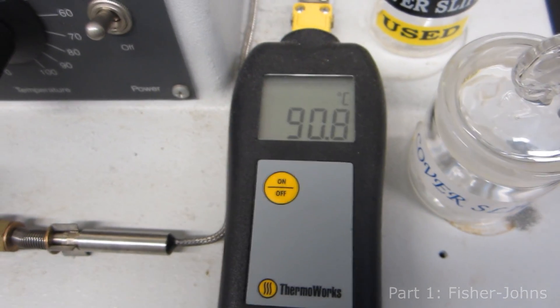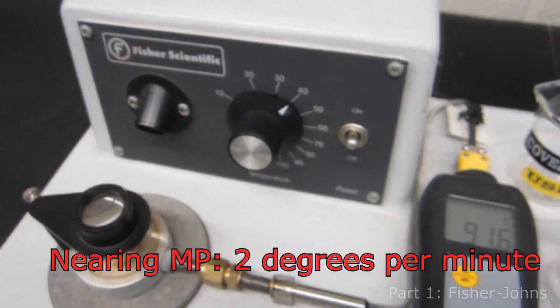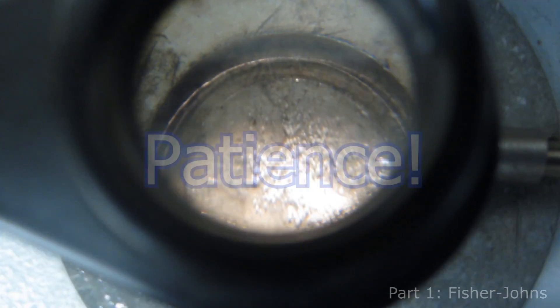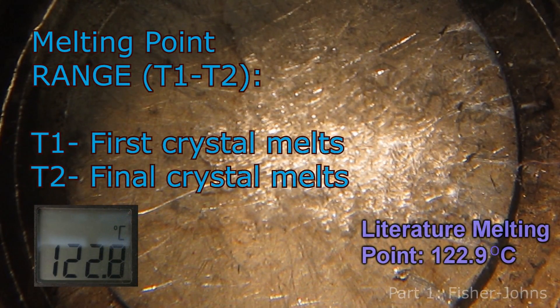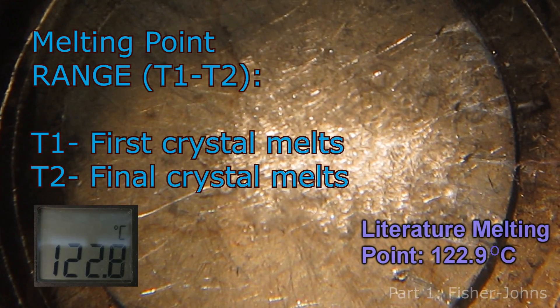Nearing your melting point, be sure that the temperature is not rising by more than 2 degrees per minute. If it is rising too quickly, turn the voltage down to 25 to 30. Be patient waiting for your first crystal to melt, as it is the only way to get an accurate reading. The melting range begins when the first crystal begins to melt and ends when the final crystal is a liquid.